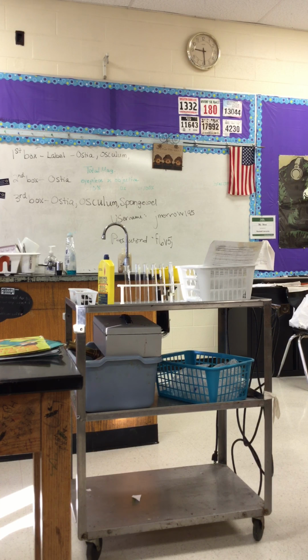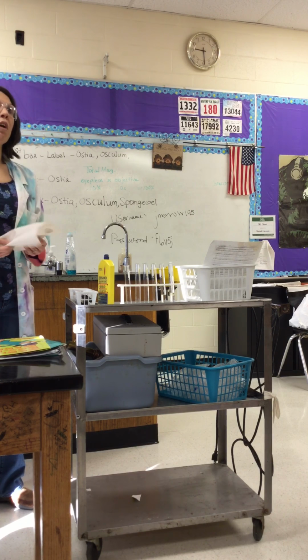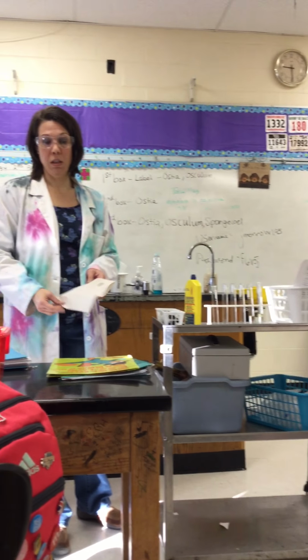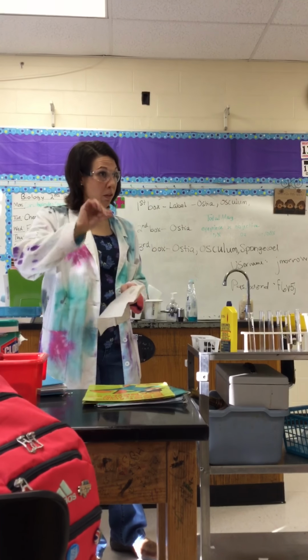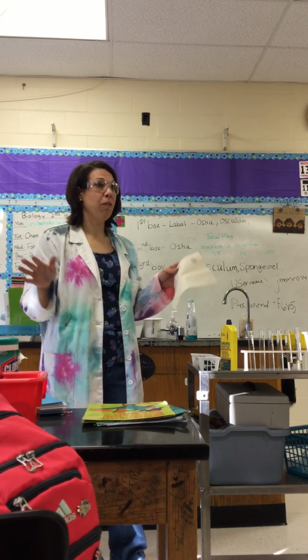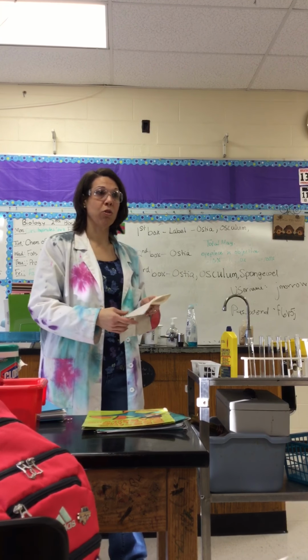I've got different tables set up so everything's at every station. You've got potatoes, cheese, coconut oil, castor oil, and Crisco to use. If you need to wash your hands or use different fingers for different ones, it's going to get messy. Don't ask to go to the bathroom. If you need to go to the bathroom to wash your hands, just go.